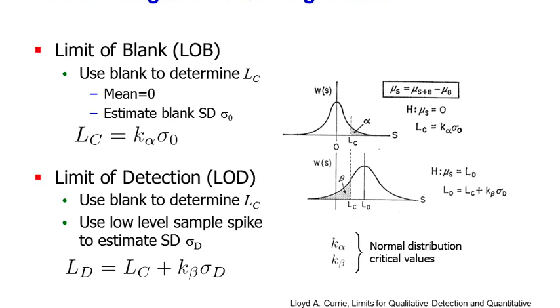And so it's possible that when there is something, you could think it's a blank. So it's the probability of a false negative. And you want that also to be small. So in other words, you want to shift the lower distribution as far away as possible so that there is minimal overlap. And how far you shift is what determines your LOD, or limit of detection.